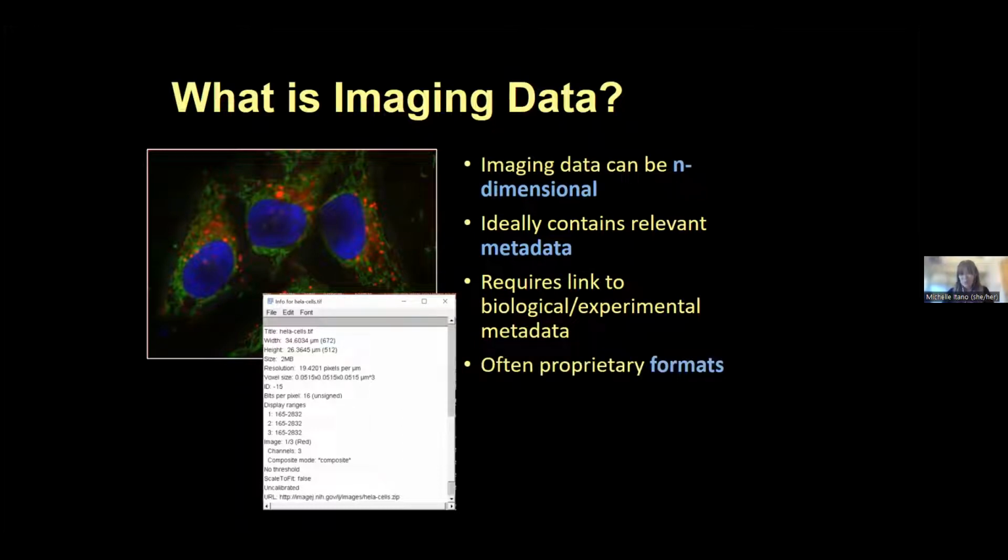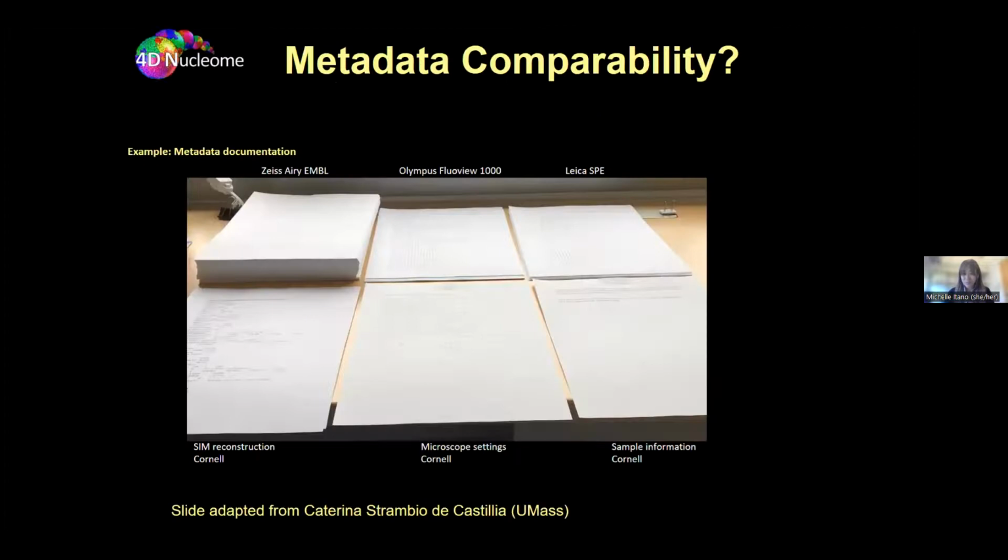Your data is often saved in proprietary formats and has to move to that in order to be analyzed or presented. And because of the way that journals require data to be changed for figures, again, all of this leads to different duplication and possibly data loss. And that's because data can be altered by both conversion and compression. Those are processes that we're working on, talking with our users about, ways that can make their lives easier, but that they understand what's happening to the data as they move it.